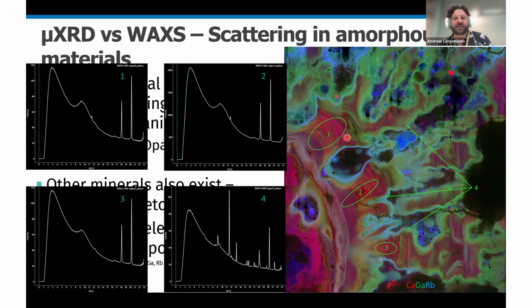And hey presto, they kind of look mostly the same. Don't worry about these 2 big peaks here. Those are just from beryllium windows on the Maia detector. They will appear in every diffraction pattern, unfortunately, because you're passing the beam through the Maia detector to get the fluorescence response. And I didn't have time to extract them out of this particular pattern.